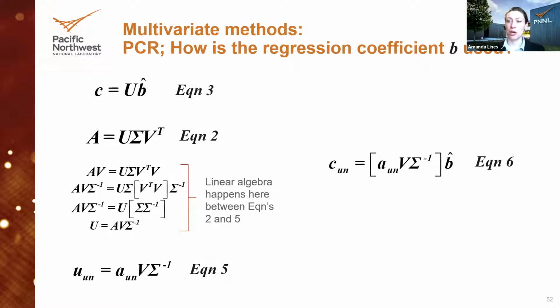Whereas if we built a model for quantifying plutonium, we'd probably use something more like a partial least squares model, or maybe even something a little bit more advanced than that, simply because its mathematics are optimized to pull out general quantification. It just looks at the data differently. I don't know if I'm getting at the answer you need here. Yeah, I think you mostly answered my question.